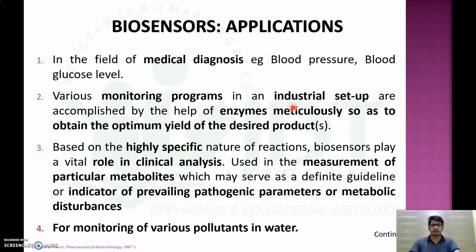So if the desired product is there in the fermentation tank, it can be monitored using biosensors. Biosensors are based on the highly specific nature of the reaction, which plays a role in clinical analysis, where it is used in the measurement of a particular metabolite, which may serve as a definite guideline or indicator for prevailing pathogenic parameters or metabolic disturbances.